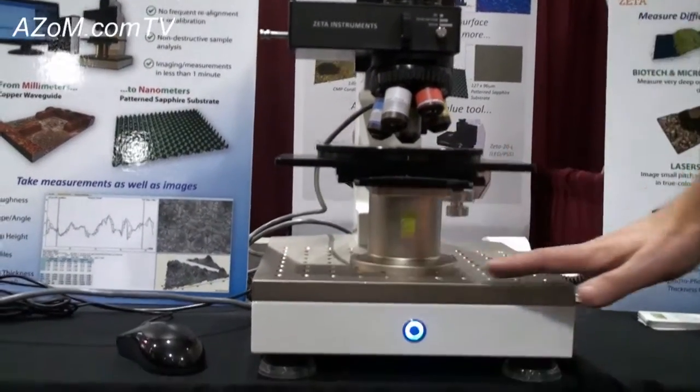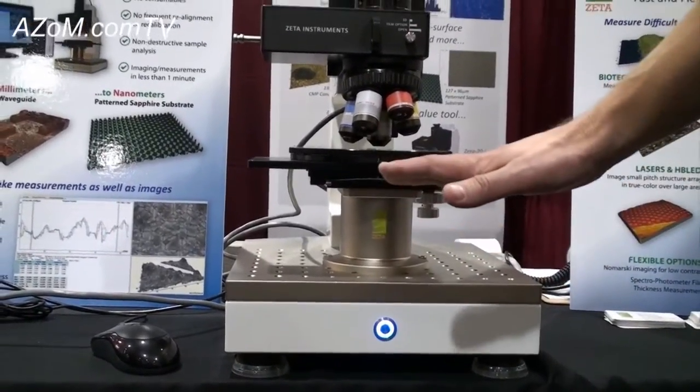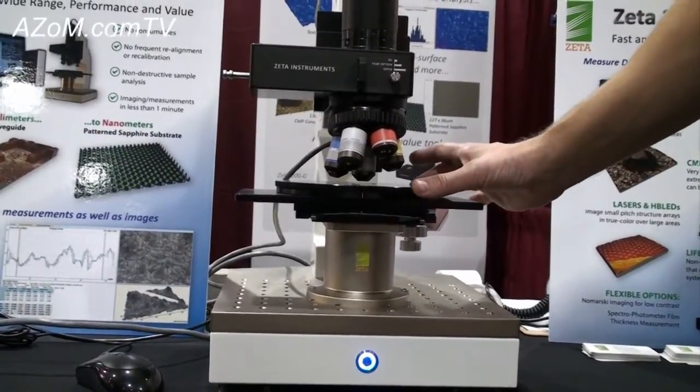On the system we have an optical base plate in which one can put their own sample holder or stage. This is one of our standard stages which is an XY manual stage with a rotation capability on the top.